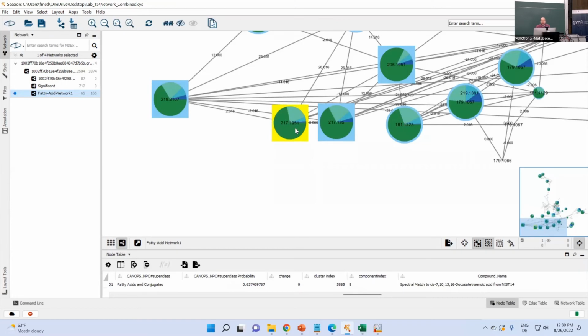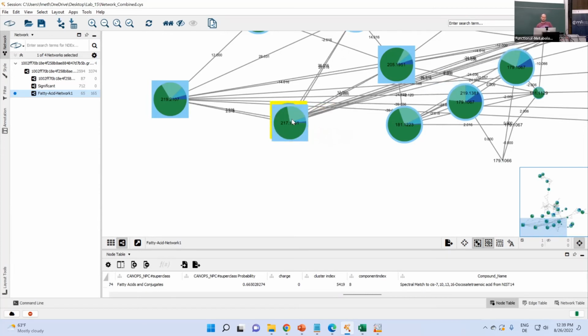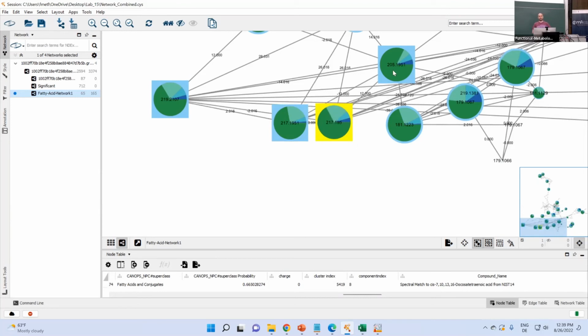So now a question that I would wonder is, are those actually really 2 resolved chromatographic peaks, or are they maybe split features, right? Because if they're split features, then maybe I should not report them as 2 individual nodes, but merge them. Or if that happens very often, then maybe I should reconsider my feature finding. That would of course be bad, because then I have to go back into the entire thing again. Fortunately, all your data analysis was in some sort of script form. So if you have to redo this, it should be fairly fast, right? To reprocess and then push through the pipeline.